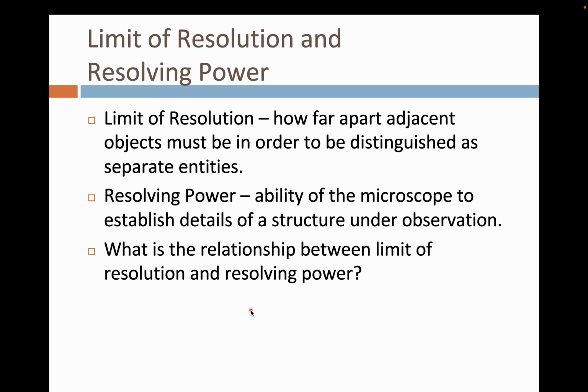Then resolving power is the one that I've been discussing a while ago in relation to limit of resolution, where of course you expect that the higher the magnification, the higher the resolving power. The more that you can see, the more details you'll get to see if you magnify your specimen.